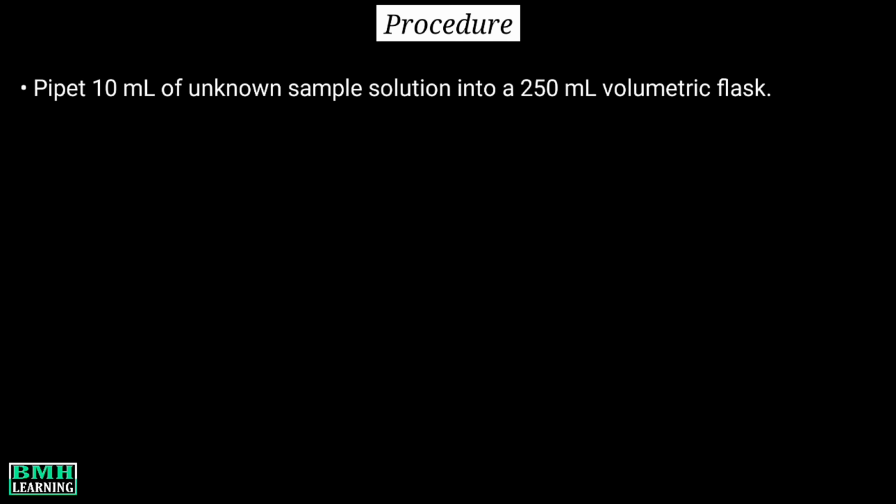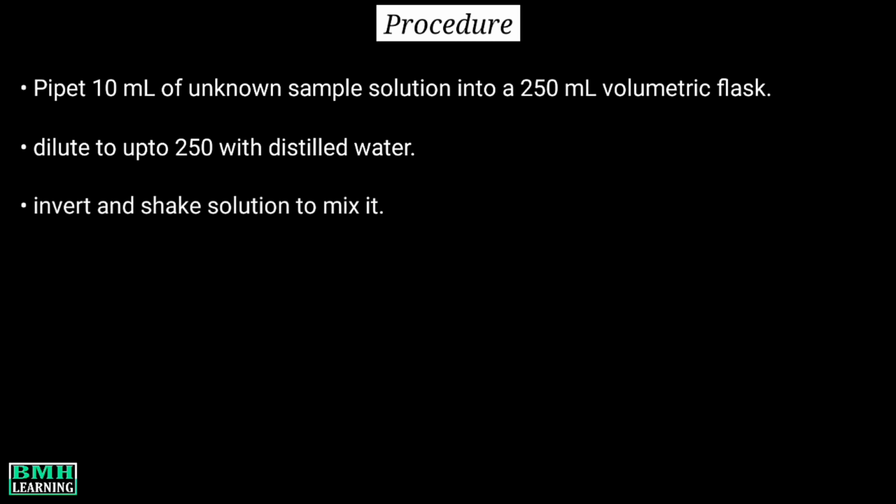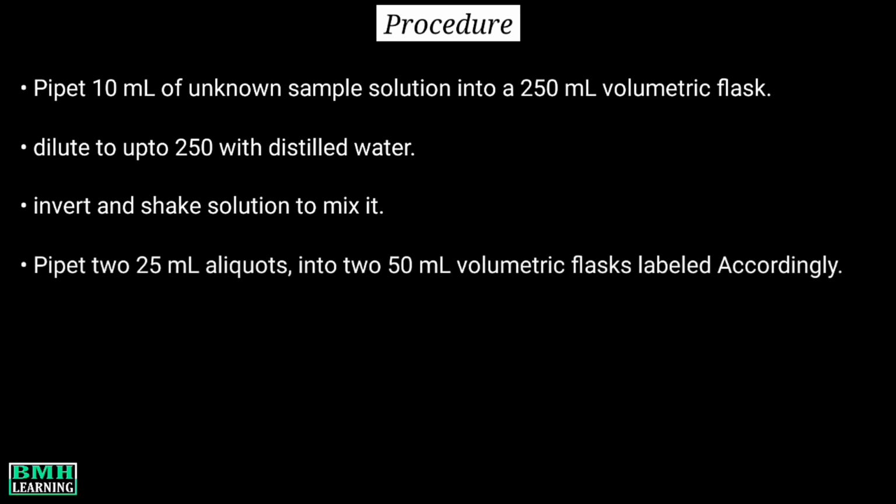Now pipette 10 ml of an unknown sample solution into a 250 ml volumetric flask. Dilute up to 250 ml with distilled water. To mix the solution, invert and shake it several times. Next, from the diluted unknown sample, pipette 25 ml aliquots into 50 ml volumetric flasks labeled accordingly.